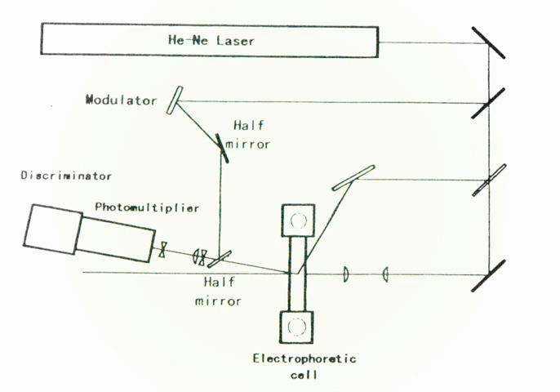This limitation can be overcome by shifting the frequency of one of the beams relative to the other. Such shifting may be referred to as frequency modulation or, more colloquially, just modulation. Modulators used in ELS may include piezo-actuated mirrors or acousto-optic modulators. This modulation scheme is employed by the heterodyne light scattering method, too.